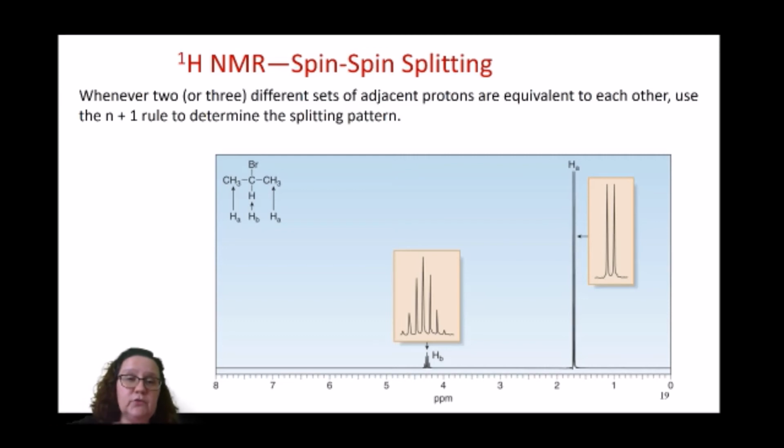One of them is what is called Ha in the spectrum. They are the hydrogens of the methyl groups, and they're identical because they are bonded to the same atoms. They will respond in the same way to the NMR spectrometer and give the same signal. As far as the NMR spectrometer is concerned, they are the same type of hydrogens.